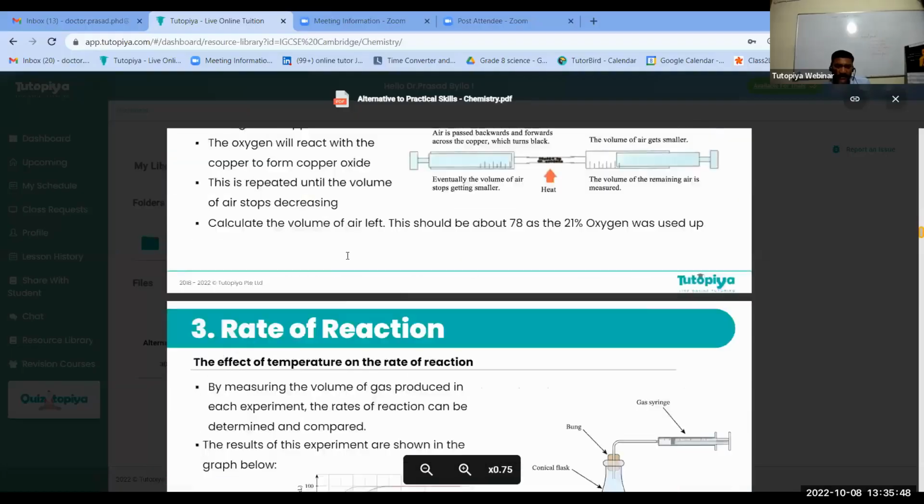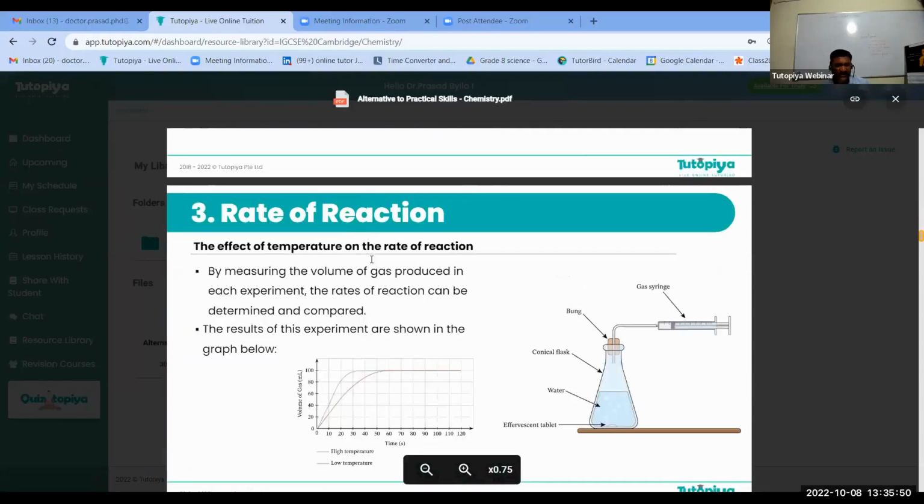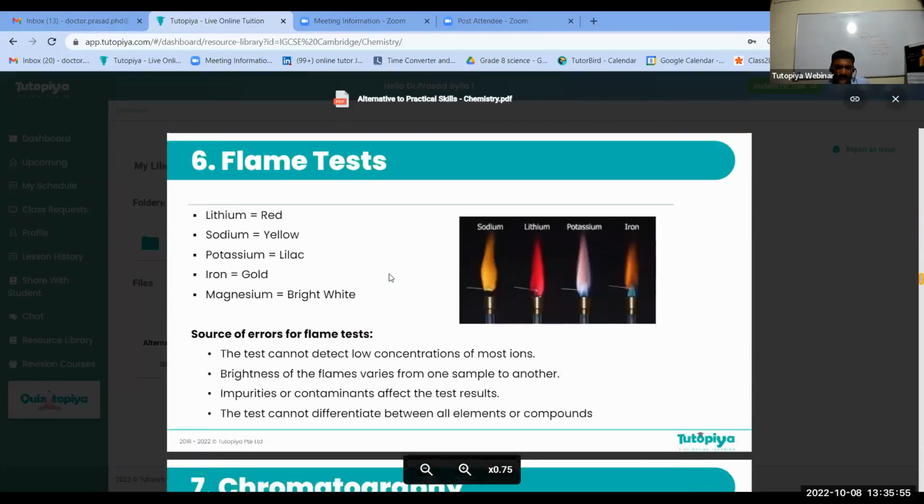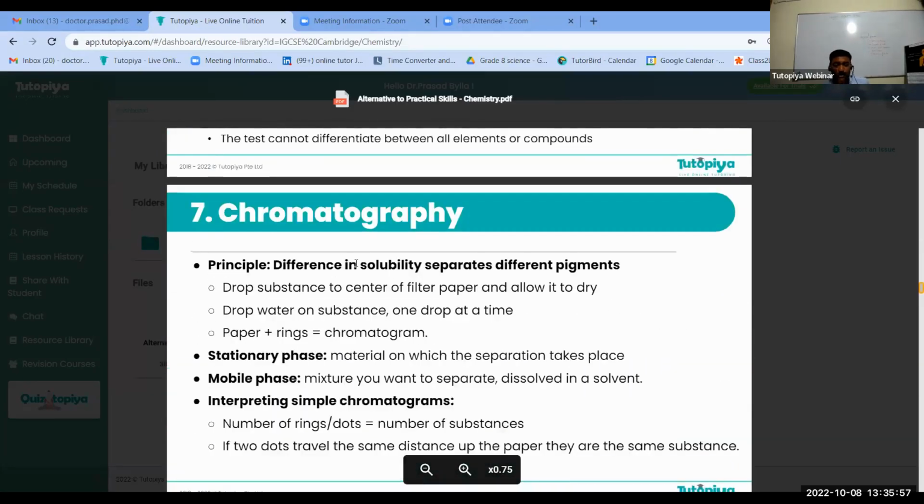Okay, right. Now, these are also other reactions, other experiments. I'll just discuss any other easier one. Yeah, we'll discuss chromatography, because chromatography is a very easy experiment, commonly conducted, commonly asked in the lab. It's easy to conduct with cheap, easily available materials.